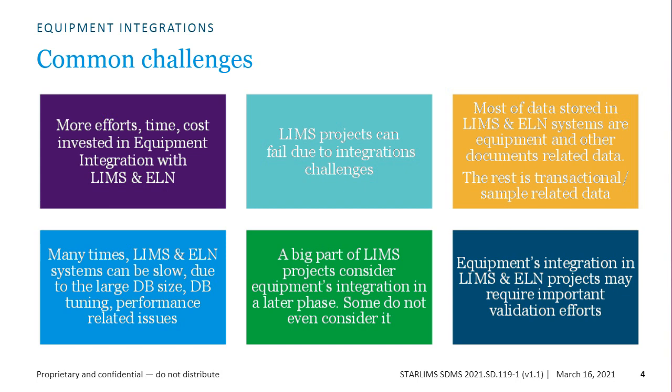And we've seen that most customers usually avoid instrument integration with LIMS, and you still continue to call it a lab automation solution. And you would never be able to achieve the so-called dream of a paperless lab if you do not integrate your equipment with your LIMS. So I have personally witnessed most customers either push the instrument integration conveniently to later phases or never do it.